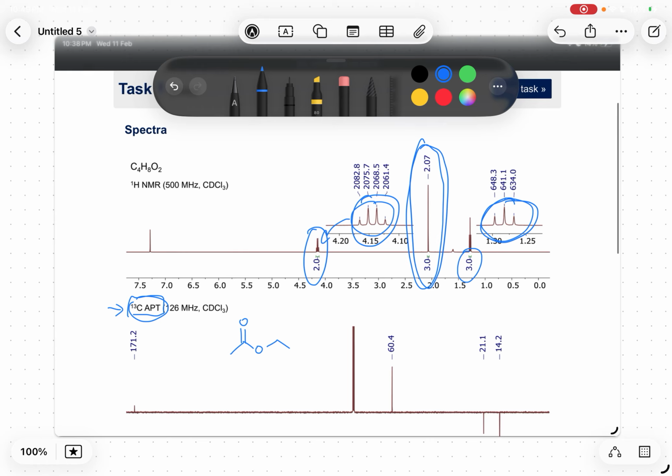That means that we have decoupled the interactions between 13C and 1H nuclei, so they do not mess up the entire spectrum. So we know that because there are so few 13C nuclei around, they don't really couple with each other that much, or at least you don't really observe them on the spectrum.